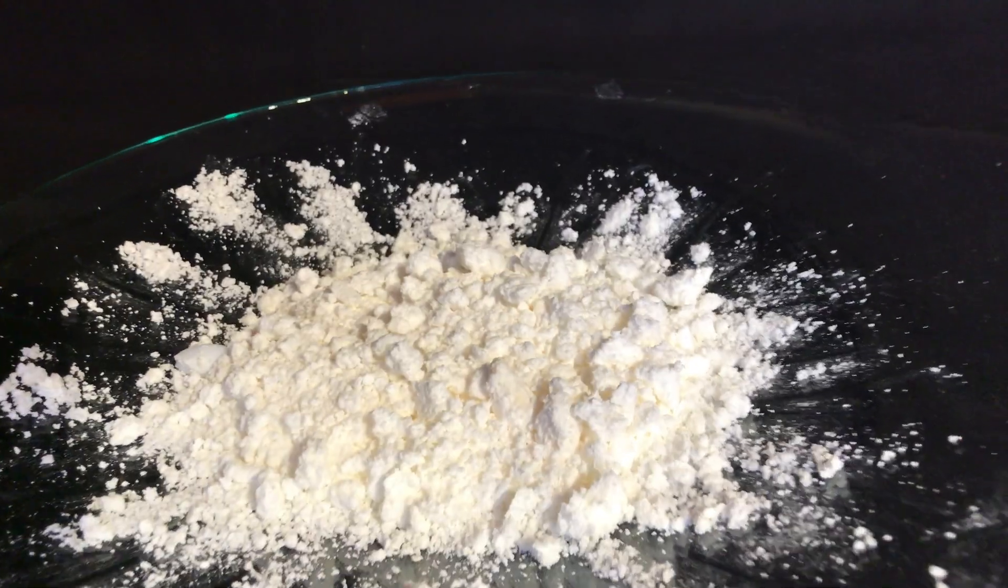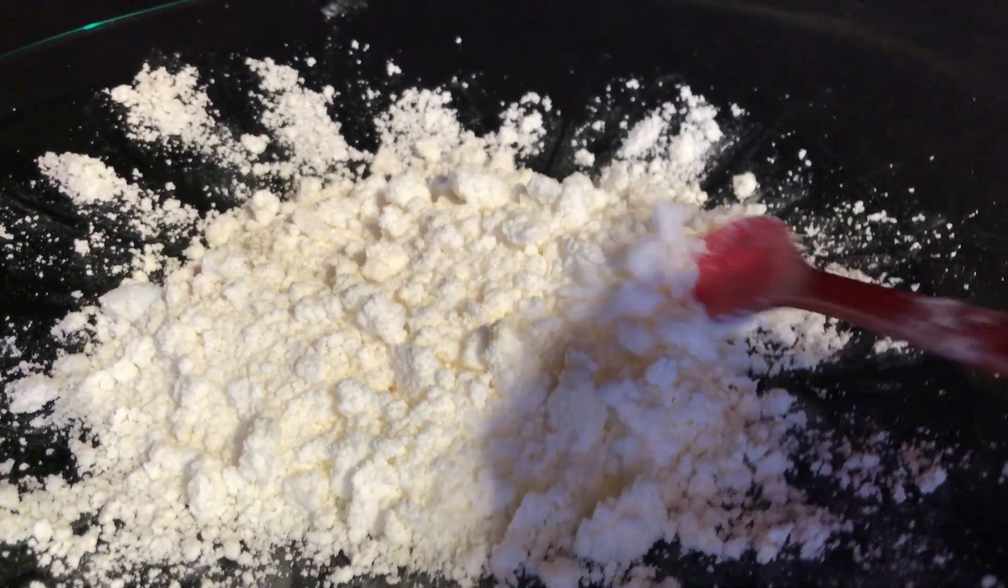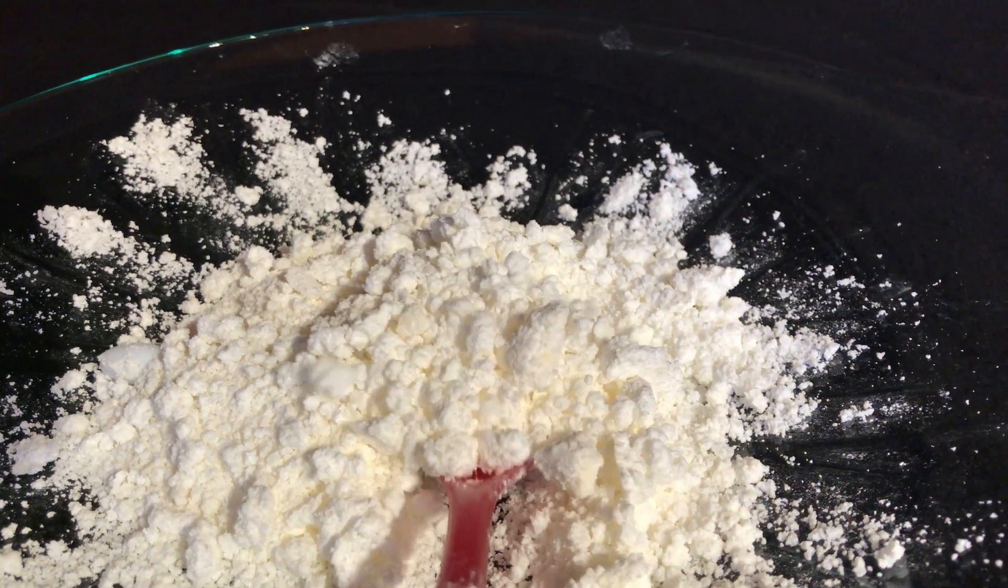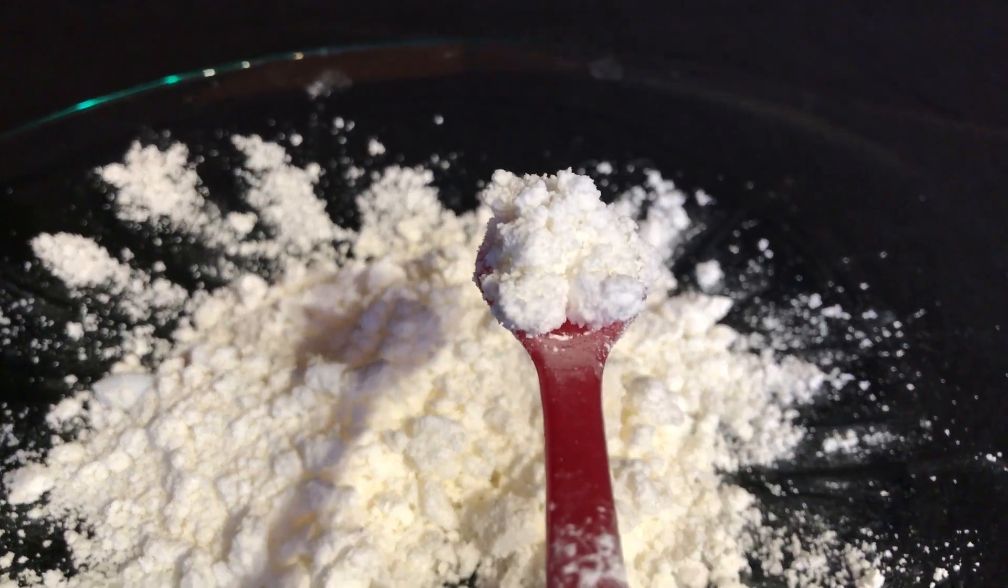We obtained 64 grams of benzilic acid with this method, representing a yield of 84.2%. Now that you've seen the classic method to make benzilic acid, I'm going to show you another method utilizing benzoin made from benzaldehyde and potassium bromate.